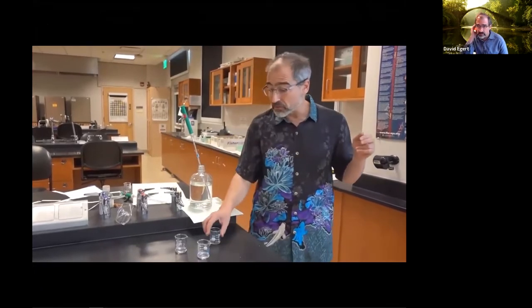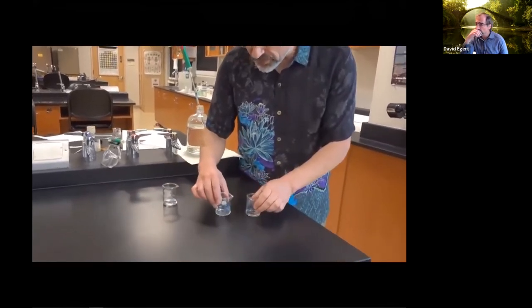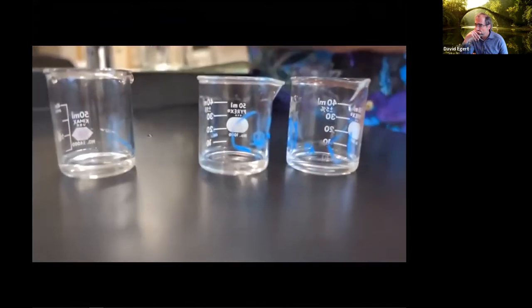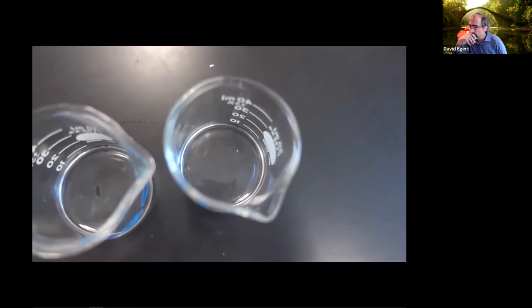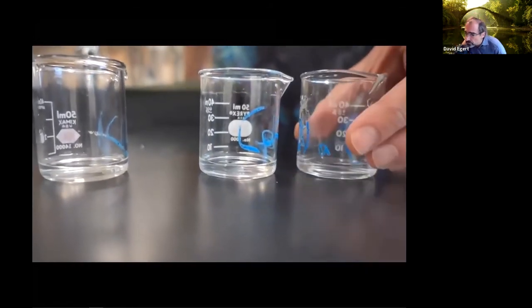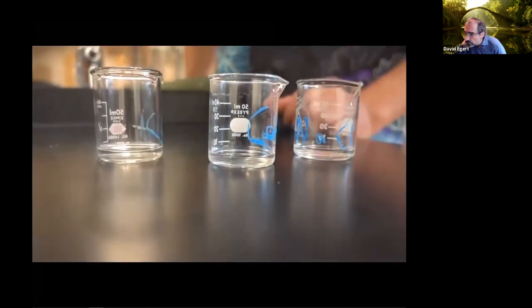What do potassium chloride, sodium chloride, calcium chloride all have in common? And I've just mixed them with water. And now, take a look. And here we're trying to record the appearance. Can you see it still? Did it dissolve? Did it disappear? You know, I have to say, looking at these, they all pretty much look like they've dissolved. I don't really see the granules in there anymore.